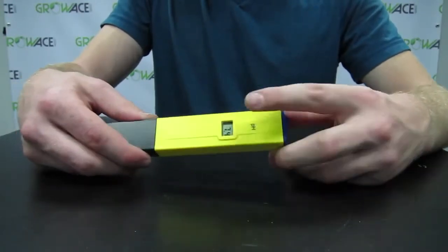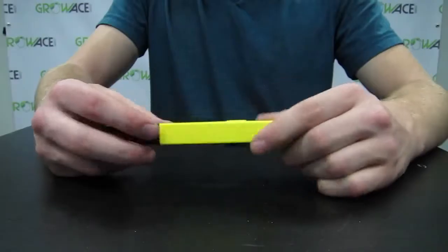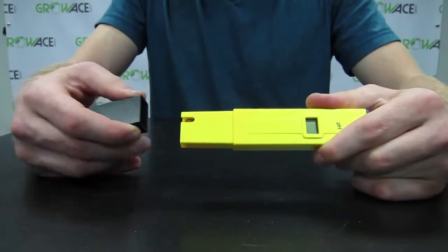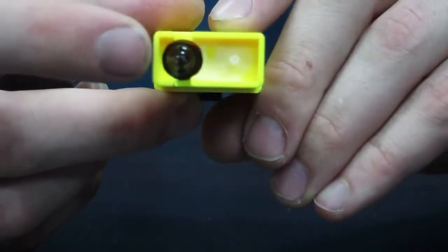Then you have your display. Flip it over and you'll see a calibration screw. Remove the cap and you'll see the electrode. It's important to keep the electrode clean and distilled. Keep it dry before recapping.